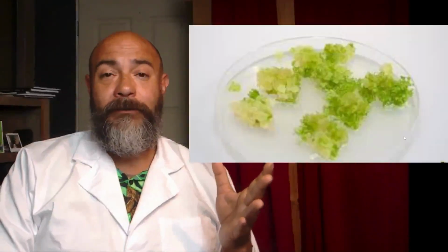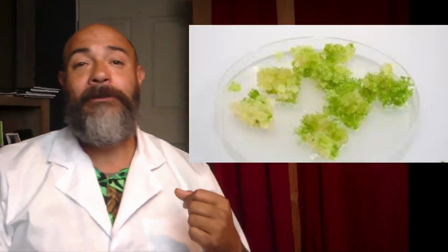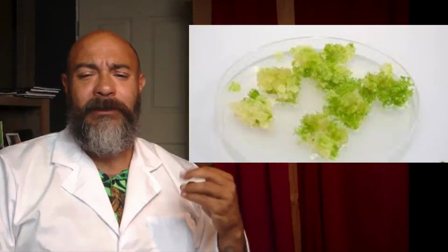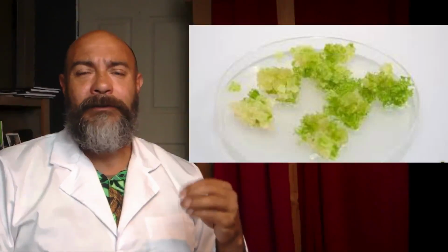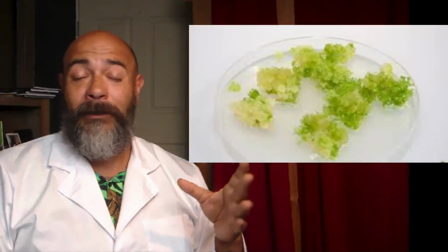And what does callus formation look like? Much like the image on the screen. Some of it's going to be green, some of it's going to be brown, some of it's going to be a little bit more compact than others. It comes in multiple different forms. When there's no light present at all, a lot of times it's white.